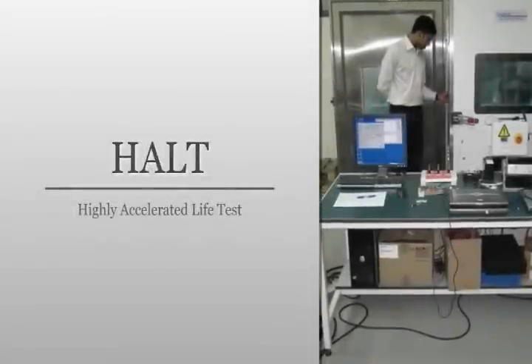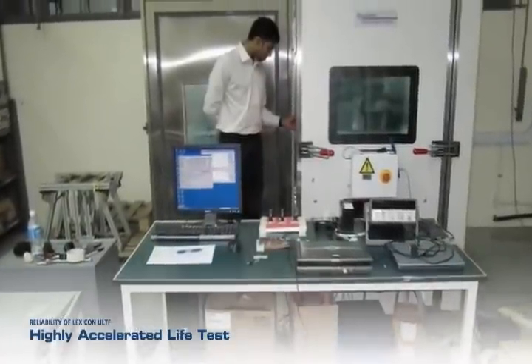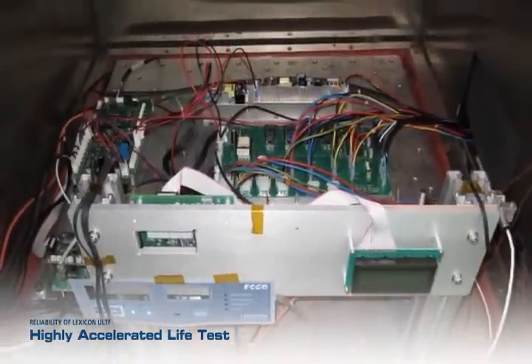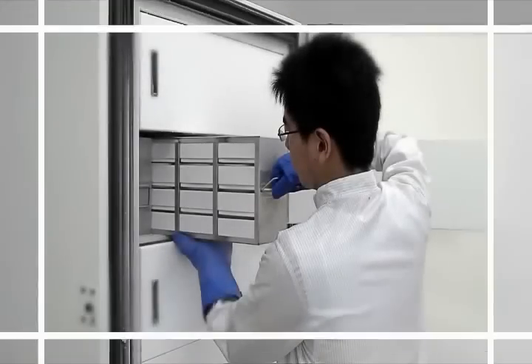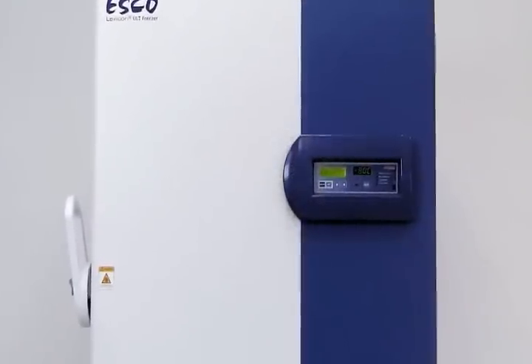The ESCO ULT Freezer has undergone highly accelerated life tests to identify possible failure modes or abnormalities. These and many other features make the ESCO ULT Freezer an optimum solution for your ULT Freezer requirements.